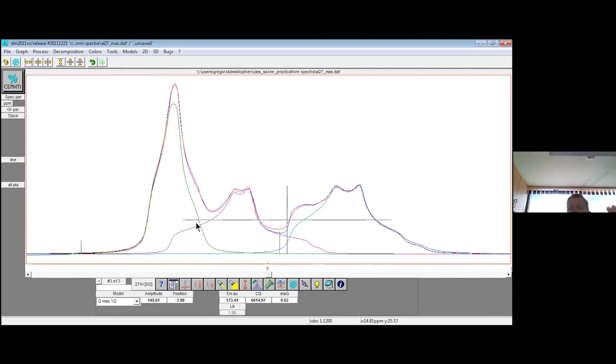I mean, the line shapes that DMFit, for example, uses are meant for excitation pulses that were infinitely narrow and high, so if the excitation pulses were delta functions. But in reality they have certain width and certain strength, and so excitation is not perfect.